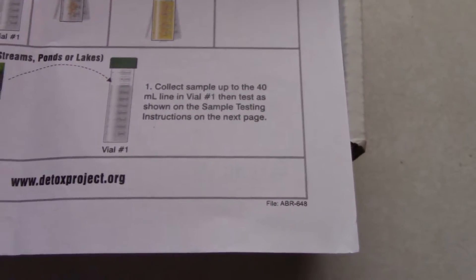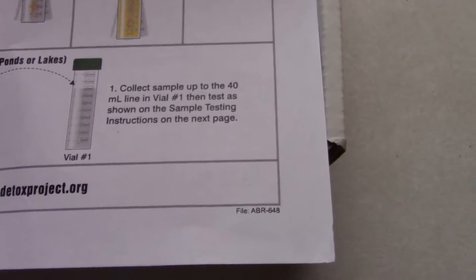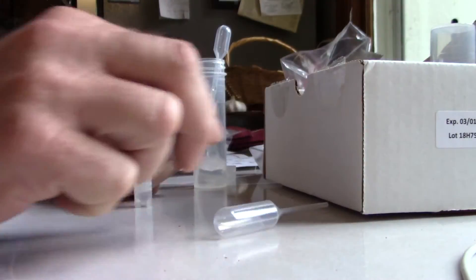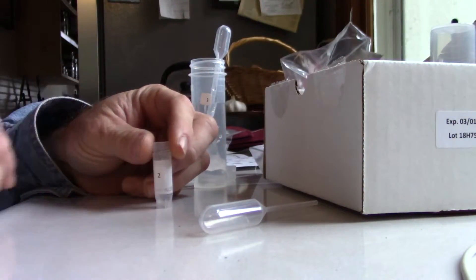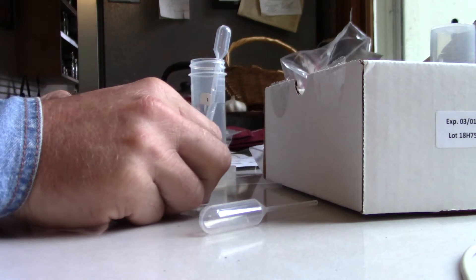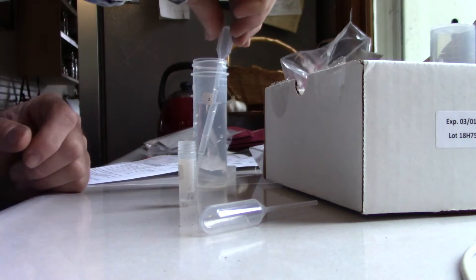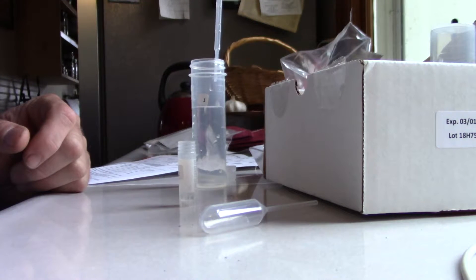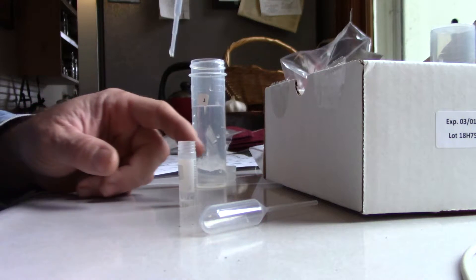So I'm almost nervous about doing this. Here we go. Tap water. Vial number two has the liquid already in it. Let's get down and turn that upside down. All right, that's close enough.